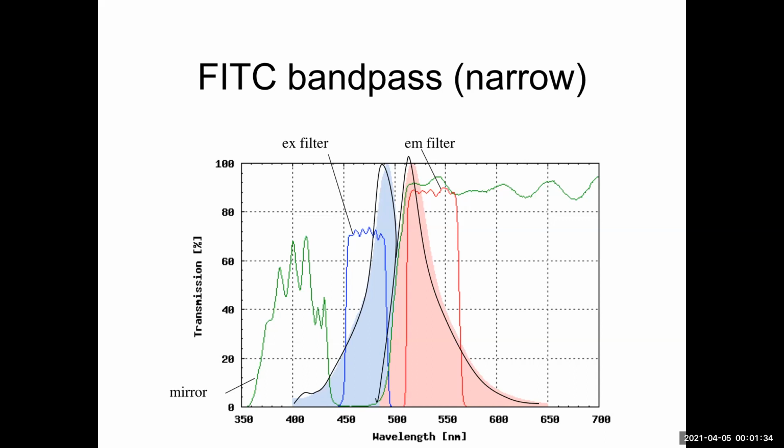And then, of course, there's our mirror, which always has a fun little shape to it. It's doing its little crazy dance in front of the 300 to 400 nanometer colors, whatever. It's just there to be amusing, honestly.